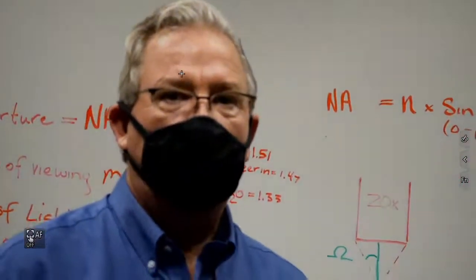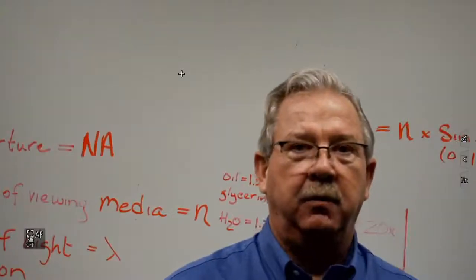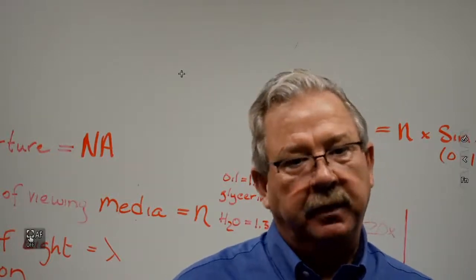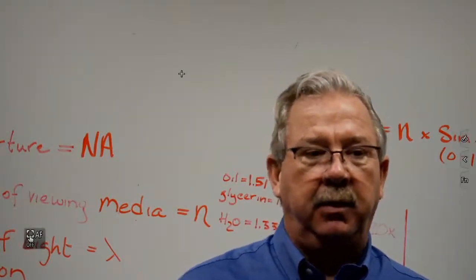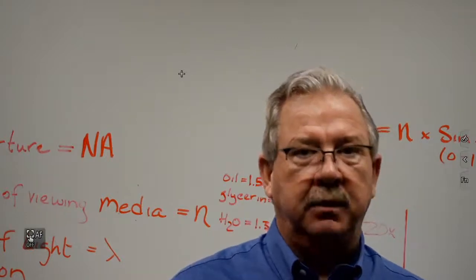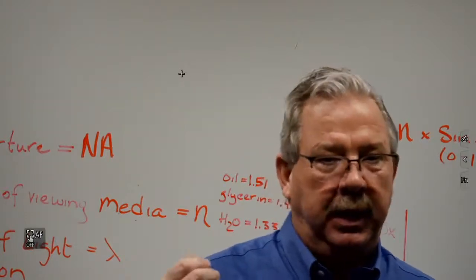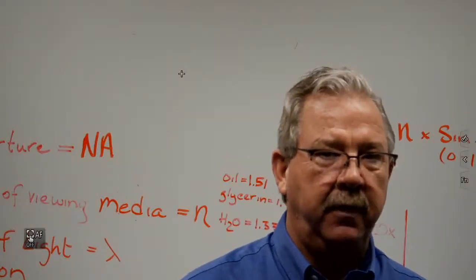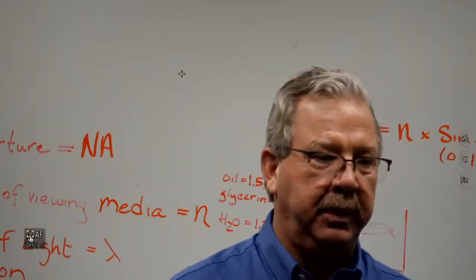Today we're going to do a little optics 101, and we're going to talk about resolution, depth of field, and try to come up with some practical application and simple understanding of what's going on when we throw formulas up on the board about optics.